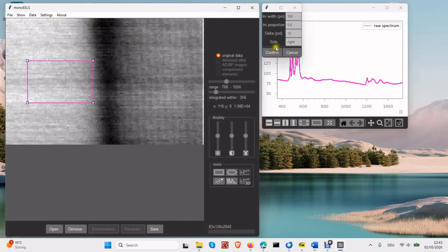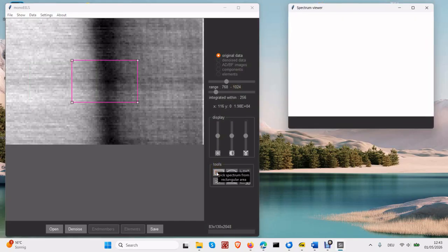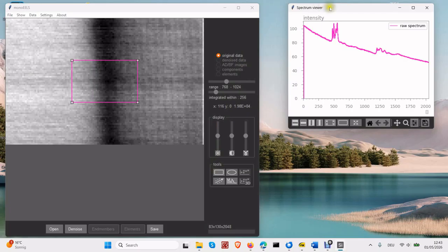Here you can define the initial width and the height-to-width ratio. Again, while you can always resize the window manually, it is worth defining a comfortable default size once and for all. What is delta? We assume that additional frames should not overlap with the main frame but instead appear at a certain offset. This is delta. Let's increase it. Now the frame appears further to the side.